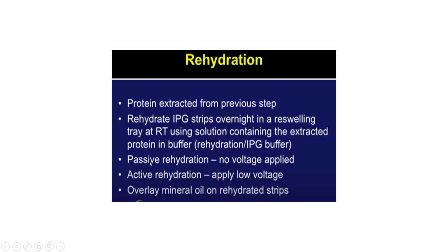If you are applying voltage, it is called active rehydration. After overnight rehydration, you will overlay mineral oil on the rehydrated strip.